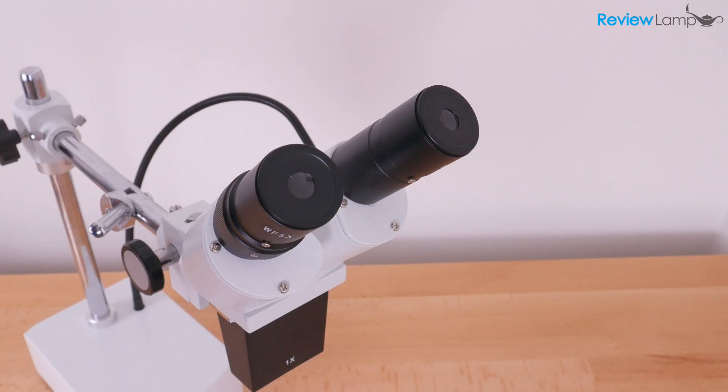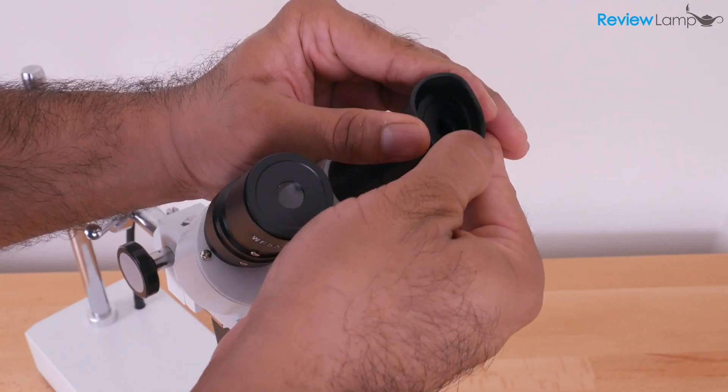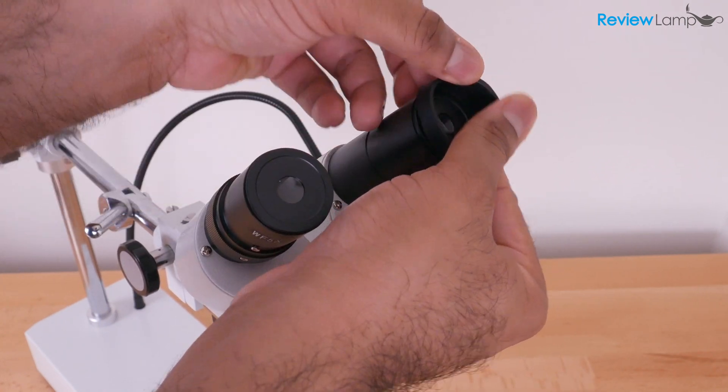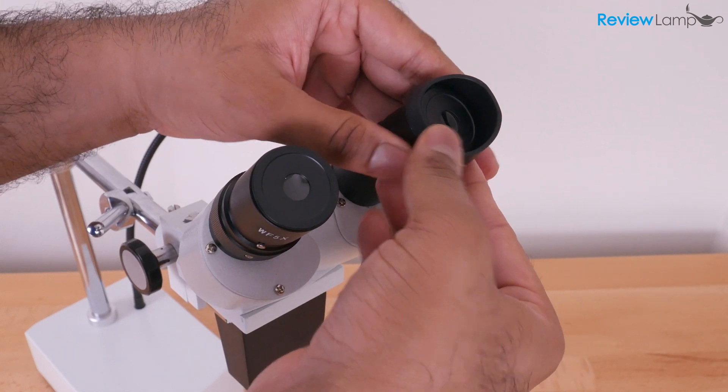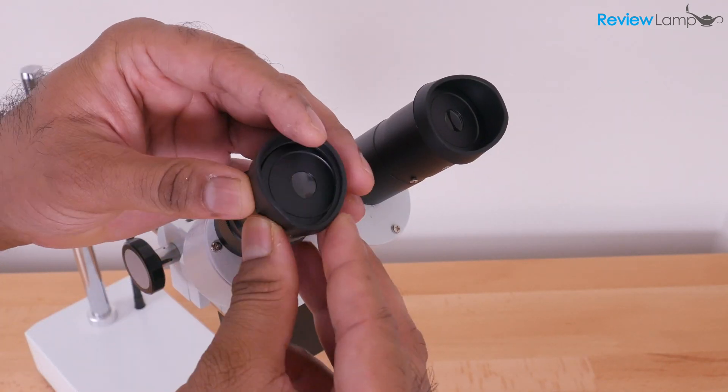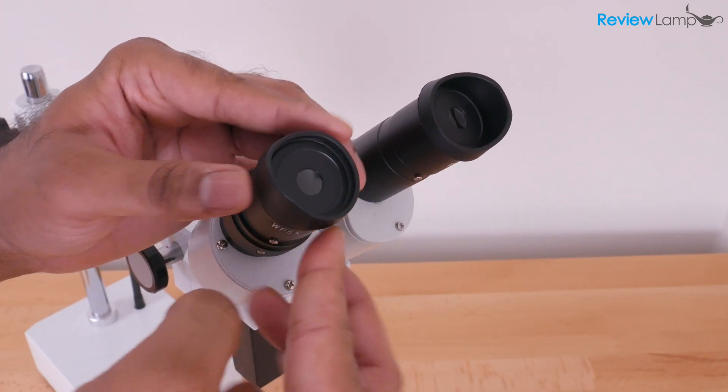So the eyepieces are now installed. And I'm just going to put the eye cups in. And they just sort of stretch over the end of the eyepiece and stretch it till it sits in that groove on the eyepiece. Let's do the same on the other side. Slot it into that groove on the eyepiece, stretch it over till it sits in that groove.